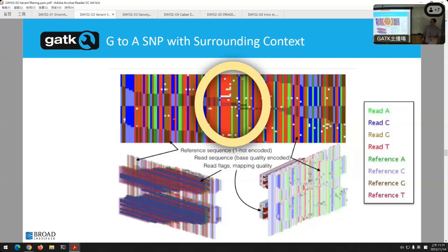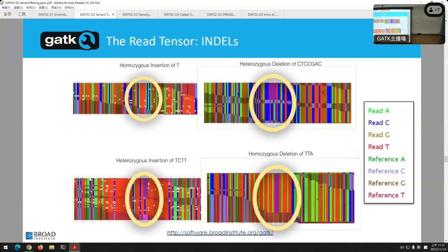Okay. And it can learn other things too. It can learn deletions. So insertions. So an insertion of a T, for example, this pink thing here means there's nothing in the reference genome, and there's a red, T is red in IGV, there's a red line here. It has learned within the whole sequence right here. This is all the reference.